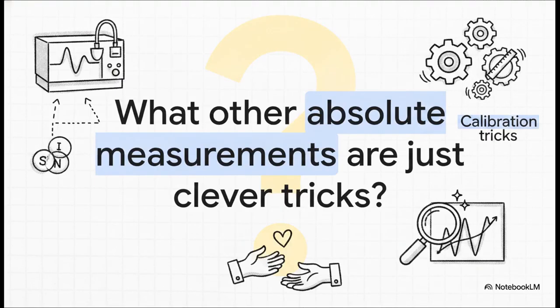So we've seen how that simple mx equals kx times ax equation kind of falls apart in the real world, and how scientists use external standards, internal markers, and normalization to find the truth anyway. But it leaves us with a really fascinating thought to wrap up this explainer. If instrument tuning constantly changes the rules of the molecular world, and our chemical measurements rely this heavily on clever relative comparisons, what other absolute measurements in science are actually just brilliant calibration tricks?